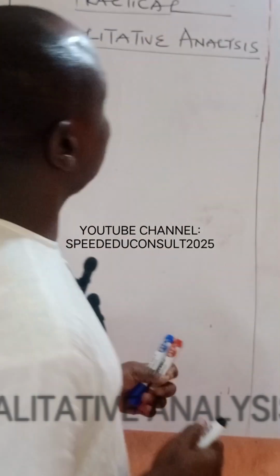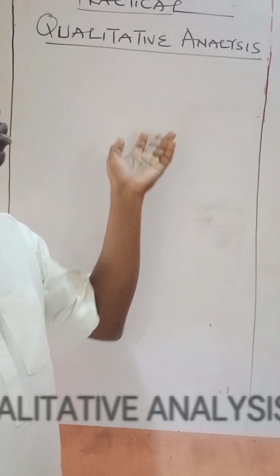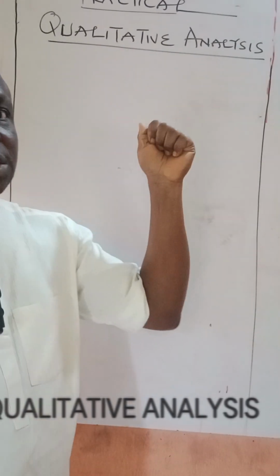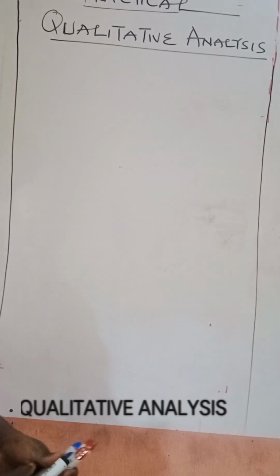We want to start with chemistry practical. As you know, chemistry practical is divided into two. We have qualitative analysis and volumetric analysis. So this is qualitative analysis.